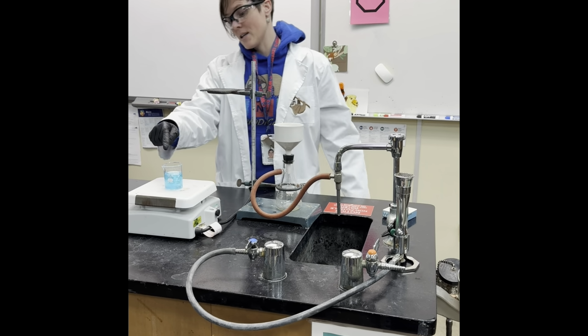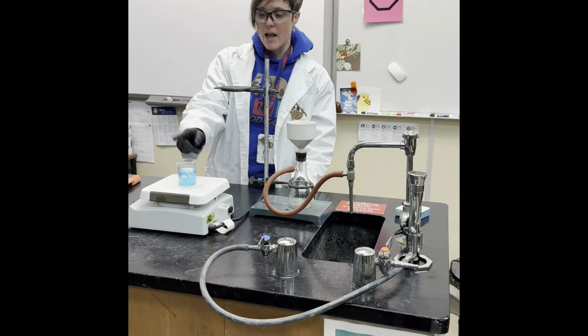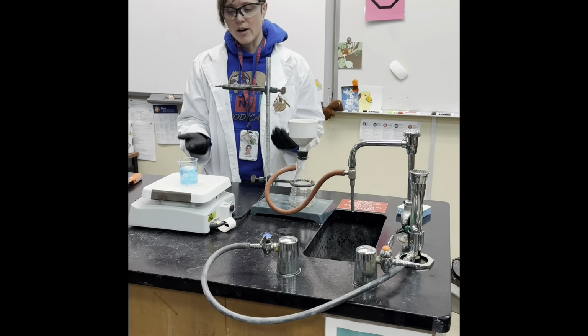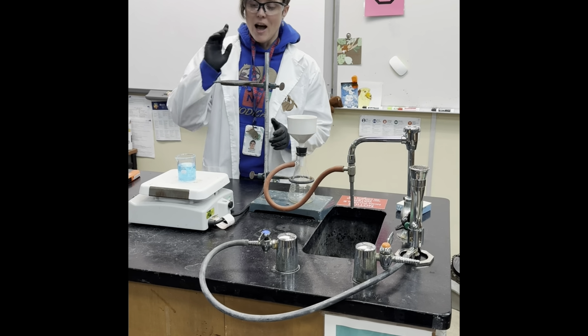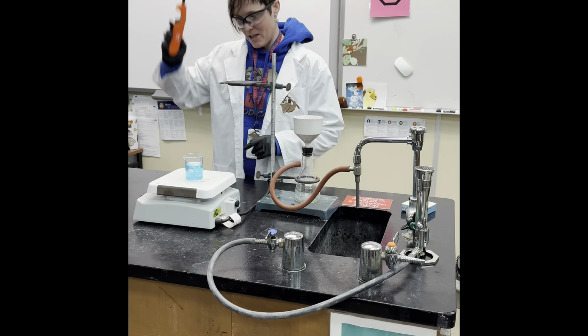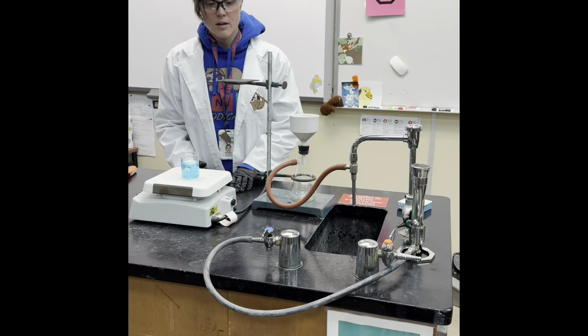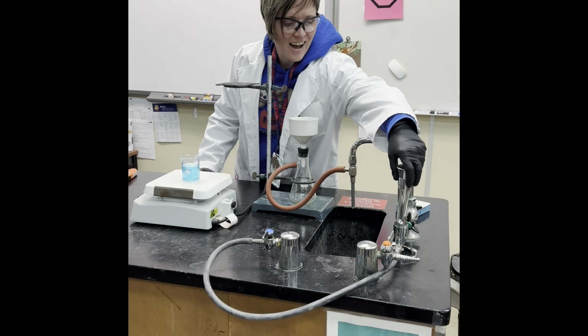I've already massed my beaker ahead of time, so I know the mass of that, and so I can calculate what my final mass is. I'm also going to dry out the product. So that's where my trusty lighter comes in, and oh yeah, my Bunsen burner.